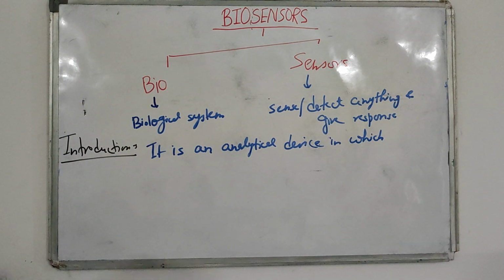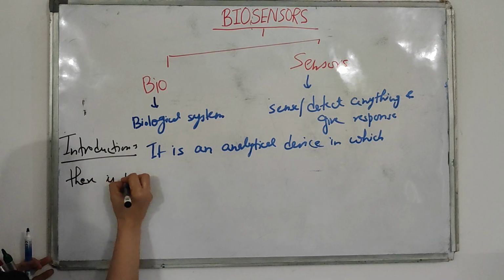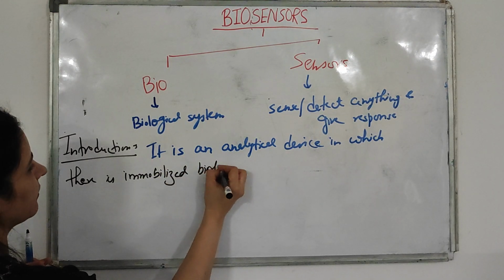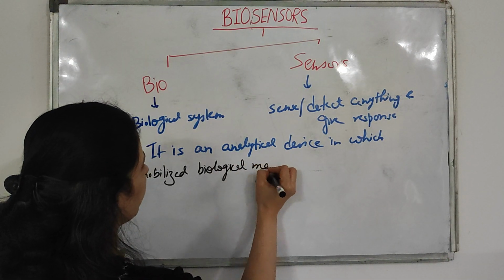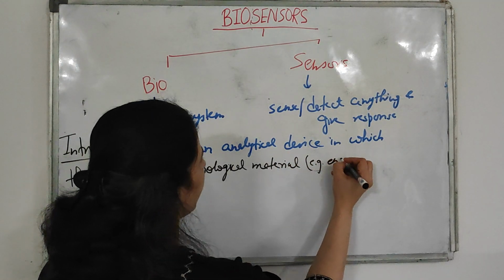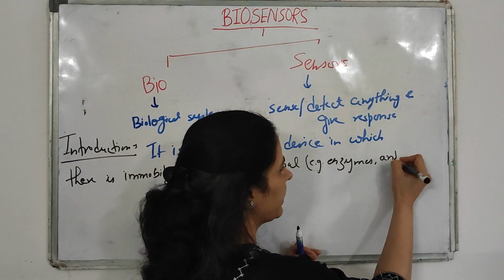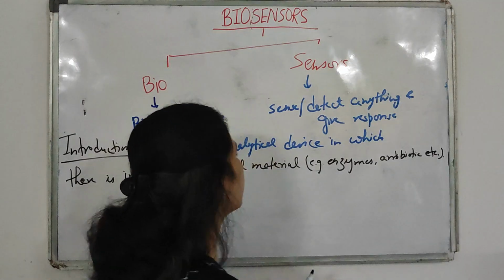In which there is an immobilized biological material. Biological material can be enzymes, or if you are using a biosensor in drug discovery, then there can be antibiotics, etc. So what is a biosensor?